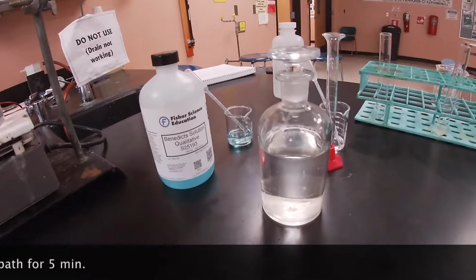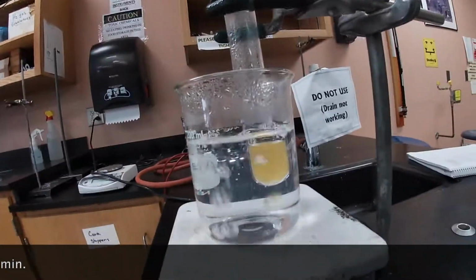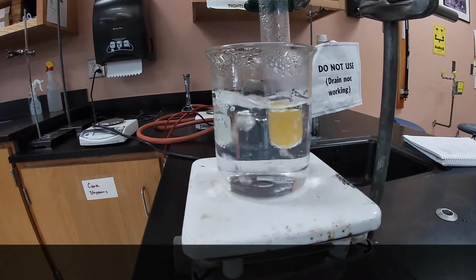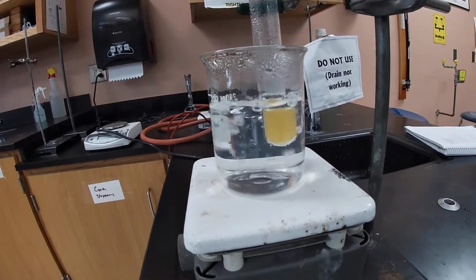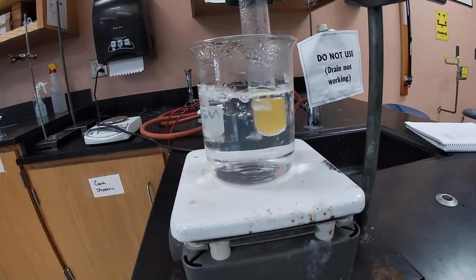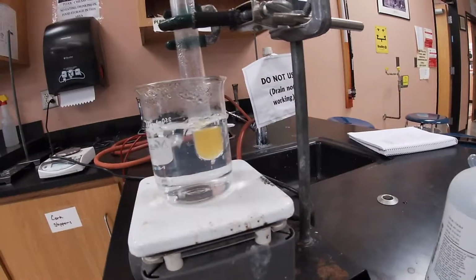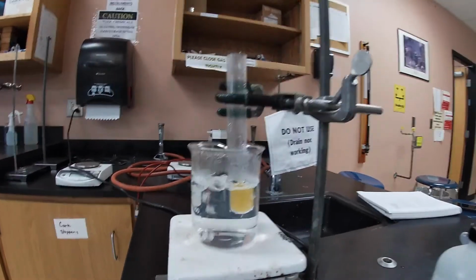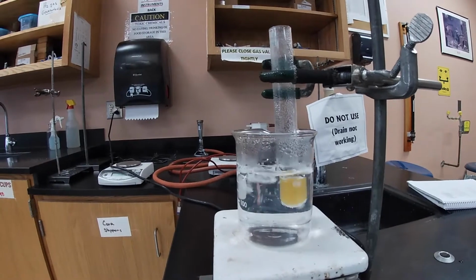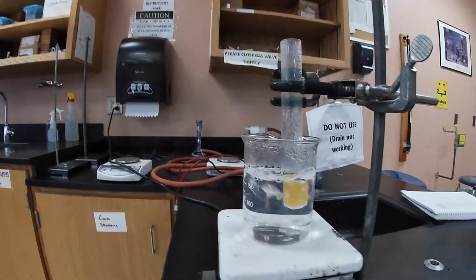And then in order for us to determine that there is sugar in there, once we mix the two and put it in a boiling water bath for about 5 minutes, you can notice the color change. Here we notice a hint of a yellow color. So anytime we put Benedict solution into a test, we put it in boiling water, if it does turn yellow, that means that there is glucose present. Okay.